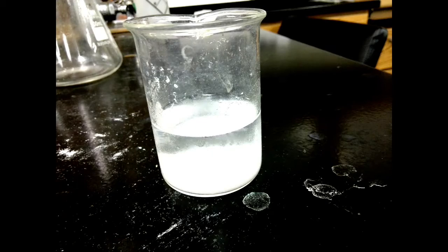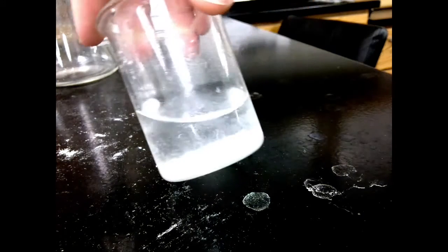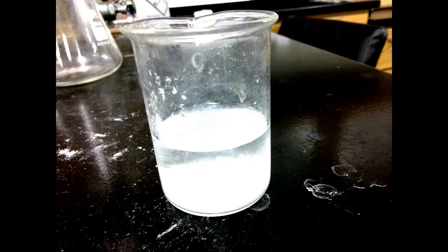All right, we're ready for our last step. We've got a beaker filled with our pure aspirin now, and we just need to get the water out of it. So in this last step, we're actually going to be measuring the amount of aspirin that we have. So the first thing that we need to do is get ready to measure that. So we're going to be putting it back through that same Buchner funnel. You may want to rinse that out a little bit.